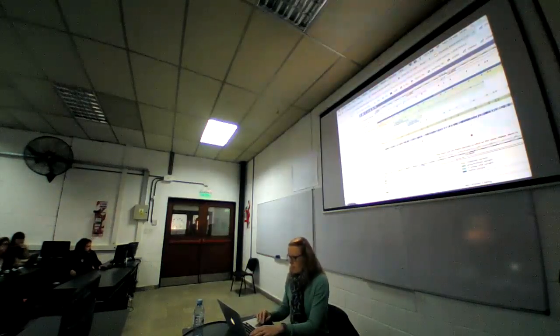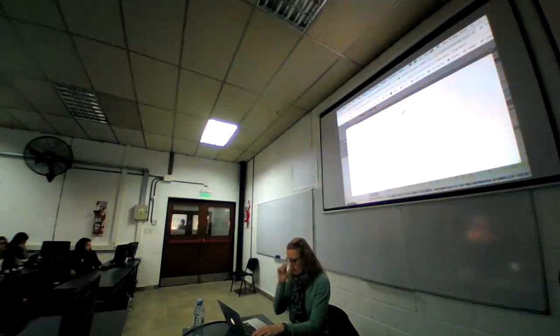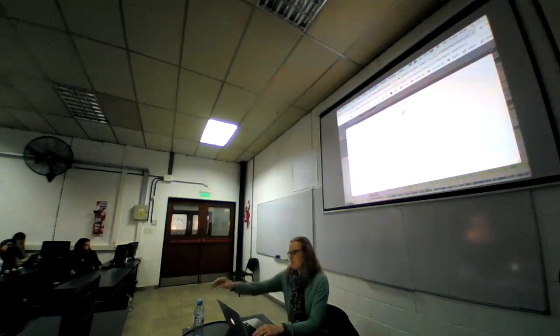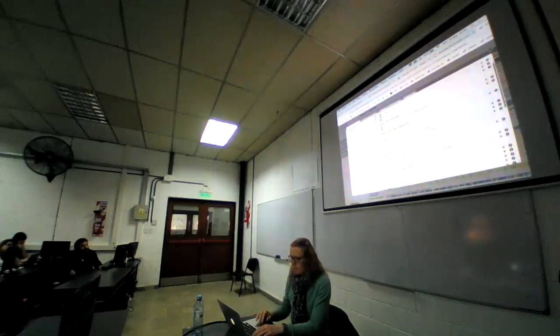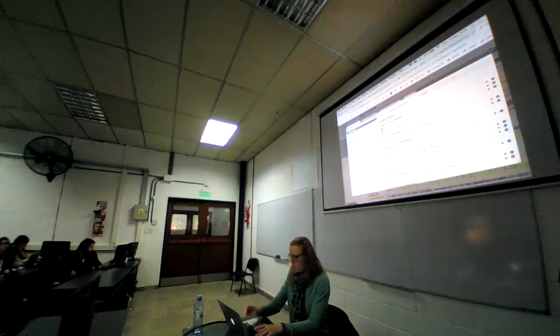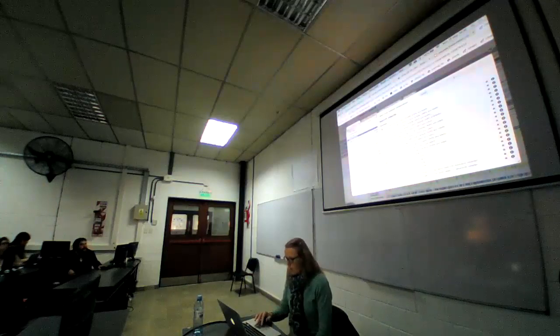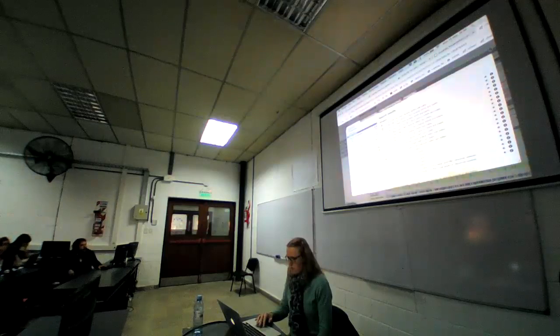I will add another one from the 1000 Genomes project. So I click on configure this page. And I could go here into the variation section and search for it, but instead of doing that, I will just type in the name into the search box. So 1000 genomes. And you can see there are quite a few. I will go for this one here, 1000 genomes, all common short variants.